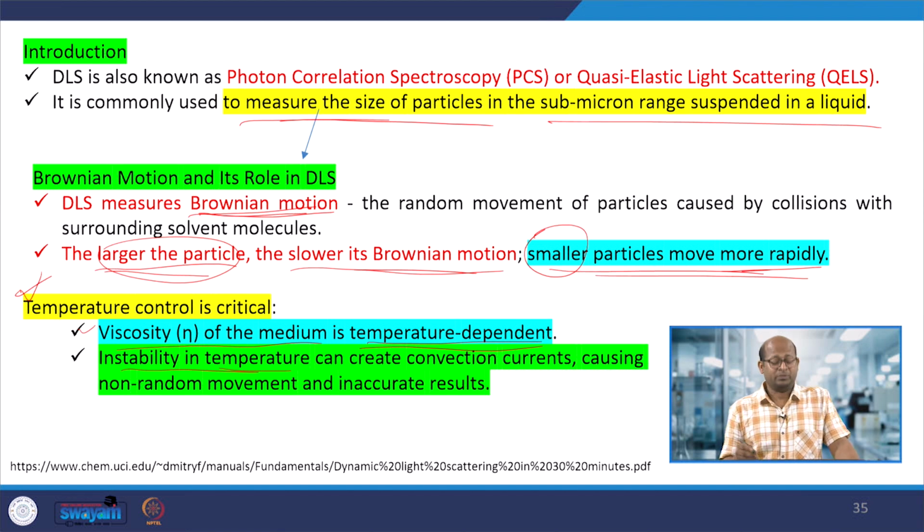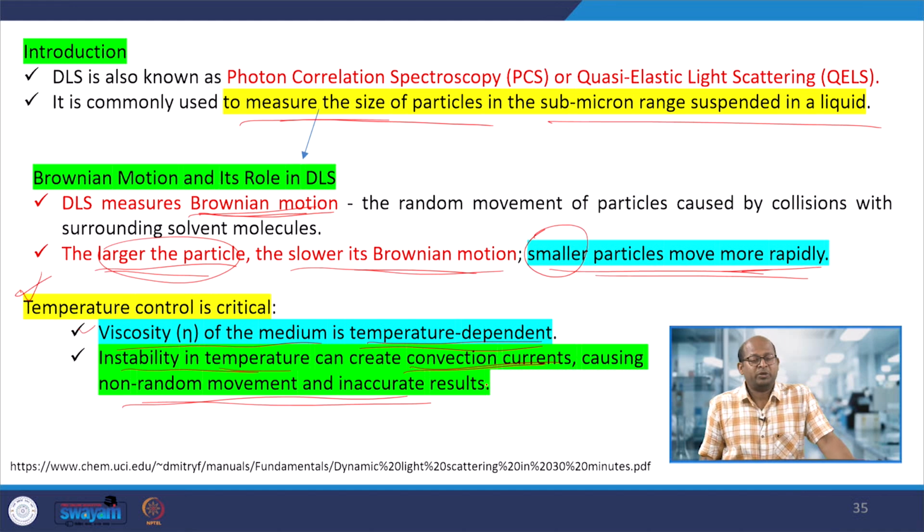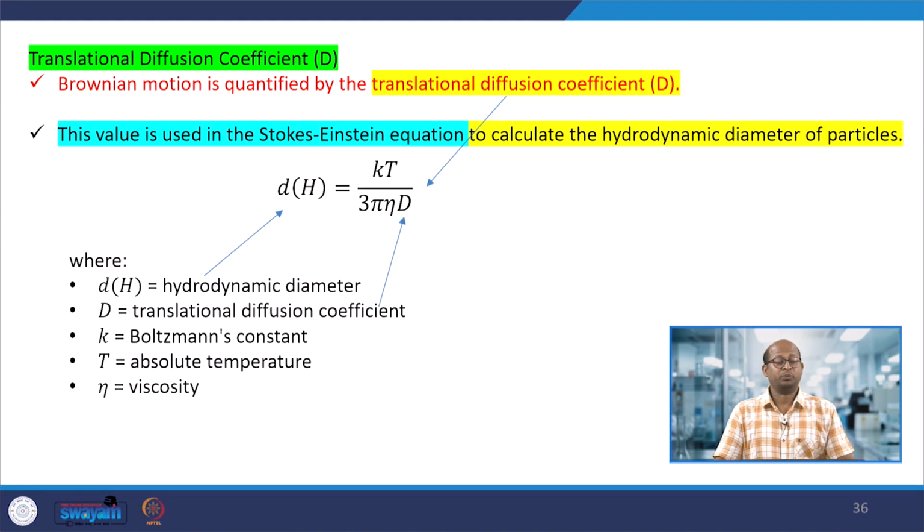whether it is low or high temperature, the convection currents, that means molecules, will move in that particular solvent. So movements will change depending upon the temperature. We can change the solvent or solution temperature, and then the movements will change also.